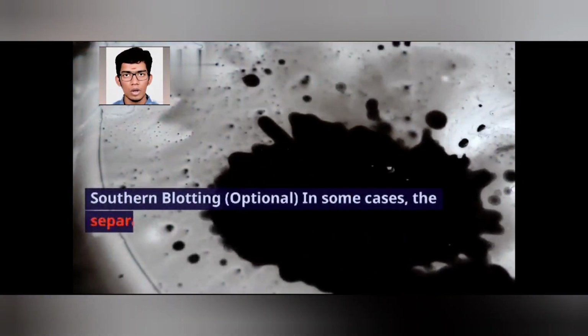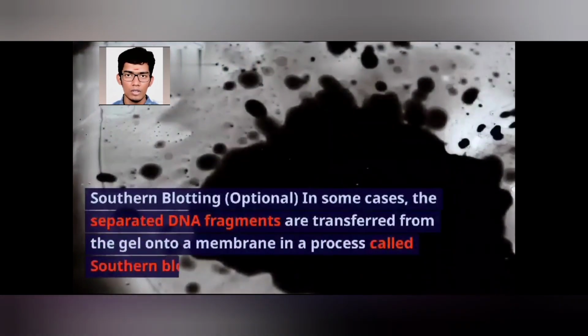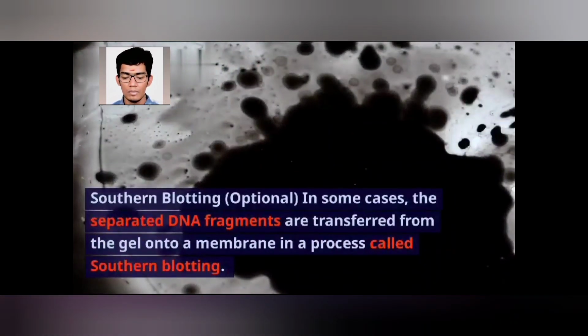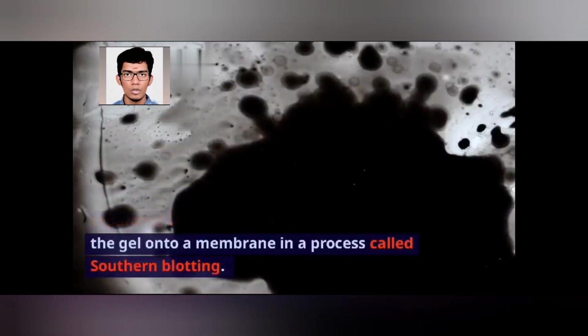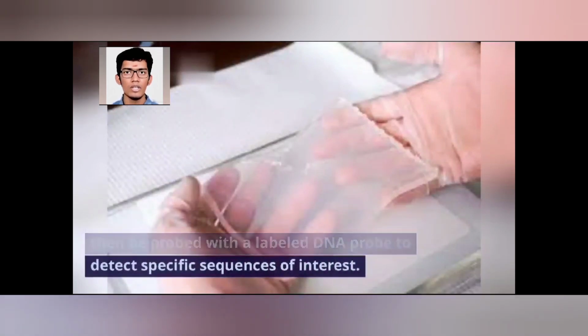Southern blotting is optional. In some cases, the separated DNA fragments are transferred from the gel onto a membrane in a process called Southern blotting. The nitrocellulose membrane of the Southern blot can then be probed with a labeled DNA probe to detect specific sequences of interest.